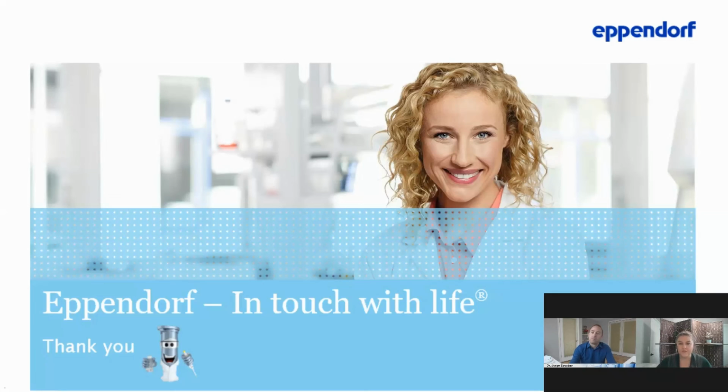We have another question, which is, how do you recommend testing the quality of iPSC throughout the reprogramming and expansion steps? Well, I have explained this in the presentation. There are many ways. For example, you can study the morphology. The morphology will change if something is wrong during your expansion.